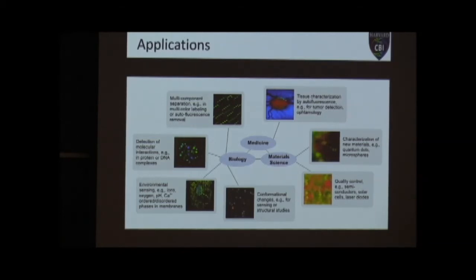So this doesn't have to be a FRET assay. The majority of the time it is, but there are some molecules out there, if you stick a fluorophore on them, during their conformational changes, whether it's binding to calcium or some other ion in your cell, or actually making a structural change, that will affect the fluorescence lifetime of the fluorophore that's plugged on there. Right? It doesn't happen often, but when it does, it's fantastic because it's a really easy assay. And a lot of you probably have a bunch of proteins of interest in your lab that are already tagged with fluorophores or fluorescent proteins.